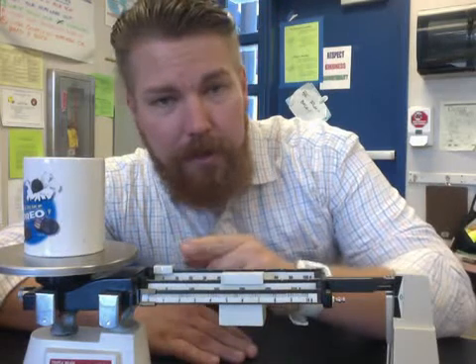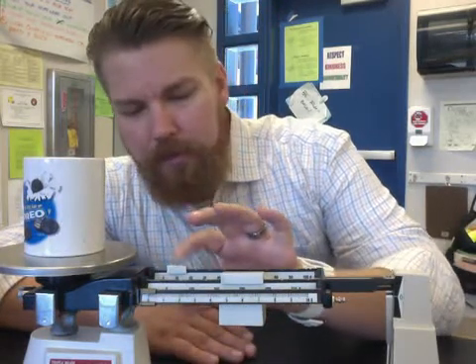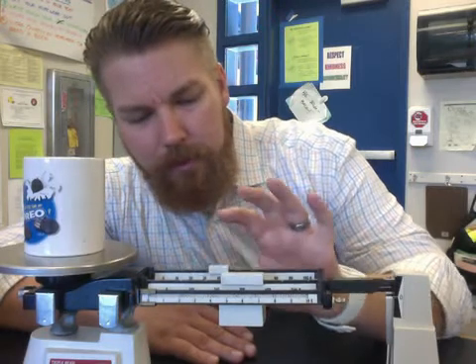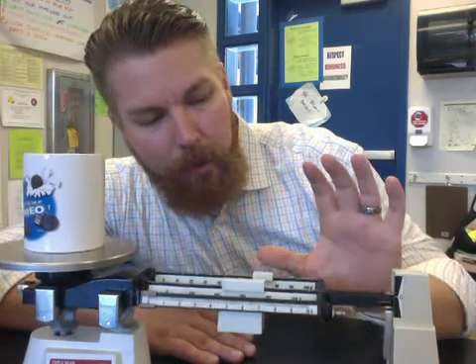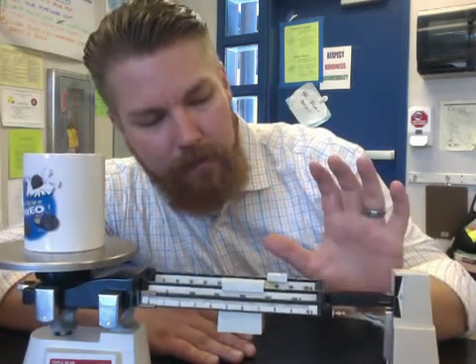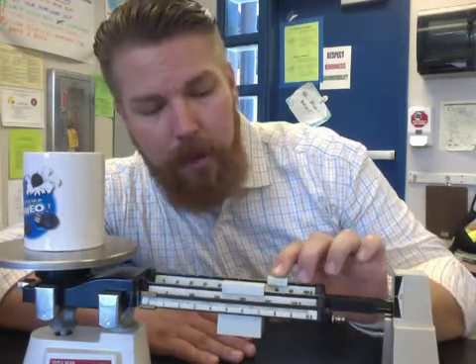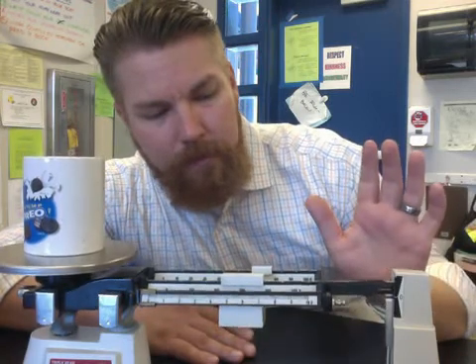Now we're going to do the same thing with our 10-gram weight in the back. Make sure it falls into the notch each time. We're getting close — and the arm fell all the way down, so we need to bring that back one notch. There we go.